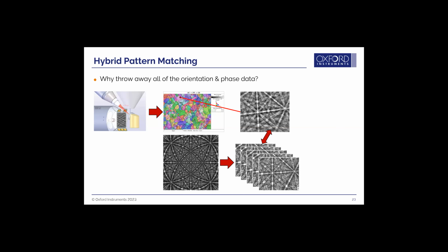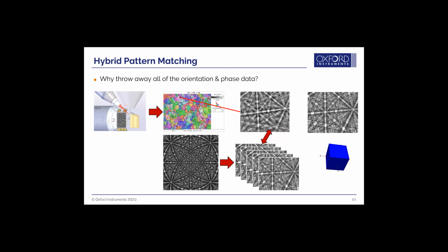It almost looks the same. There's just very, very slight differentiation there. And if you can see this on your screen, it's actually doing this refinement. It's doing a regression to see which pattern fits the best and get the maximum R value. You can see this little shift. It almost looks like it's moving in and out of the page, not just shifting, but we're trying to fine tune the solution and come up with exactly the right orientation and phase for this one. So the bonus here is it's fast.